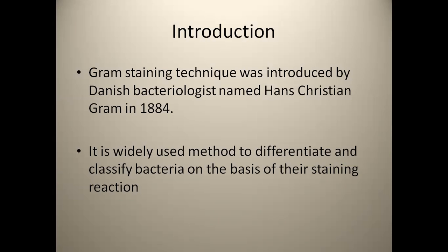Nothing is changed. So the Gram staining technique was discovered by Hans Christian Gram, a Danish bacteriologist, in 1884. Till now, most of the laboratories, research laboratories, hospital, clinical laboratories, microbiological laboratories, everywhere we are using the Gram staining as the basic and preliminary technique.